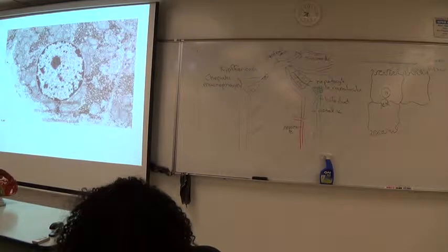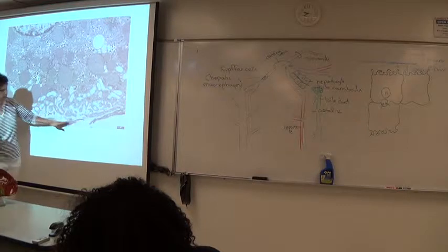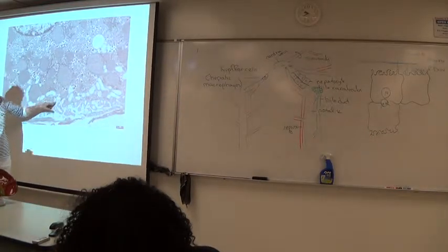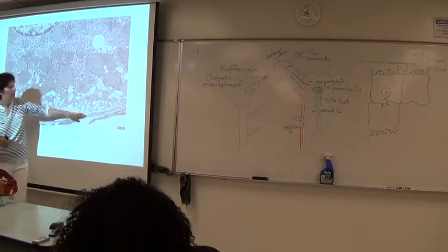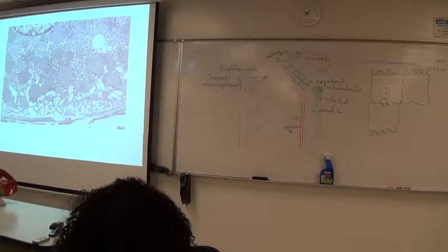So this is showing an electron micrograph of a hepatocyte. We'll look a little closer at the edge of it. So a lot of mitochondria. This is a hepatocyte. This is the simple squamous cell of our sinusoid way down here. These are those microrugae, microfolds, and this would be the space of Disse. So we're moving glucose through this space into the liver cell, albumin back out.